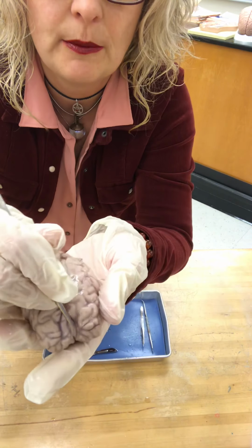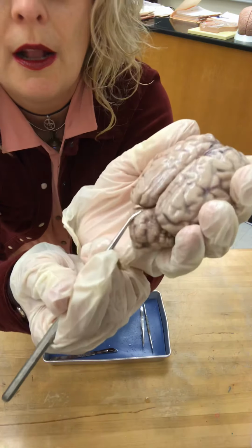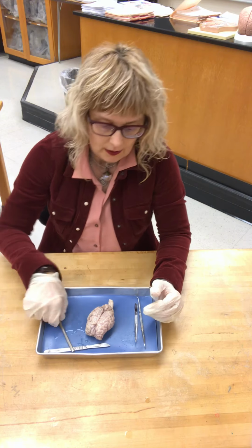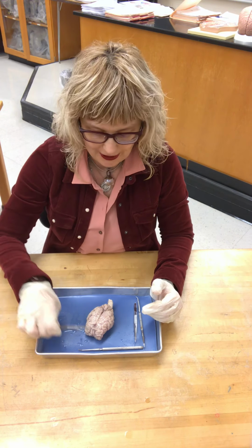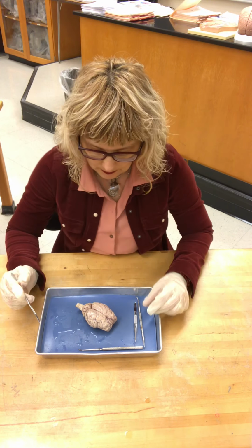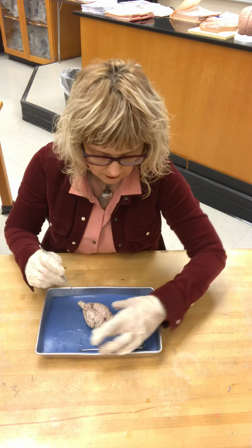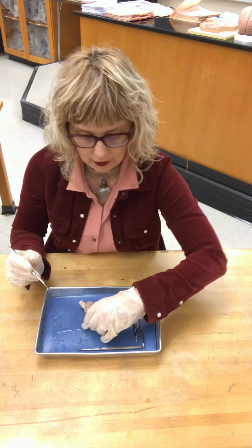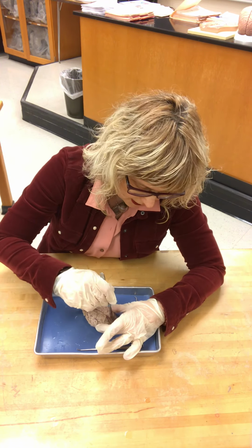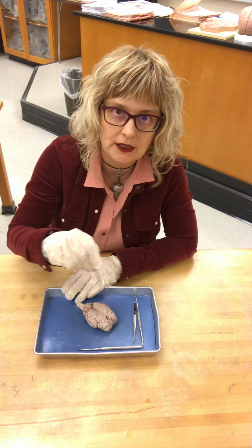Now what I'm going to do is I'm going to cut with a sagittal cut along the longitudinal fissure through that cerebellum. So let's see. I'm going to sit down. It's a little bit harder to do the video when you're dissecting because I have to bring it all the way up to the camera. So I don't know if you can see this, but you will be doing this in lab. So you use the scalpel like a pencil. You want to hold on to the brain. You don't want to cut up here in the air. So really just kind of tag it so you don't cut yourself. And do one nice clean cut. Don't keep sawing so you have different incisions.